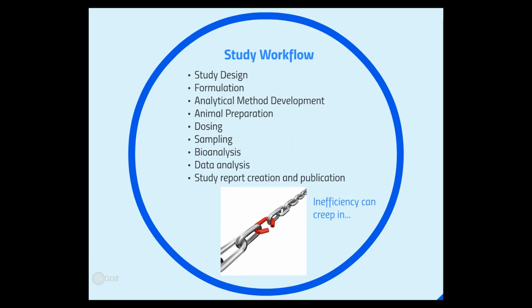Another example of a workflow would be a more study-based workflow, which might be more tactical in nature. So here we're talking about a study that involves lots of different people. It might not just involve scientists within the same organization. It might be that we're doing the bioanalytics, for example, outside with a contract research organization. So we've got to go through the process of requesting the overall study, running through the study design, requesting and receiving formulation information for the drug, as well as doing things like method development for the analytical techniques so they're available for bioanalysis and formulation testing.